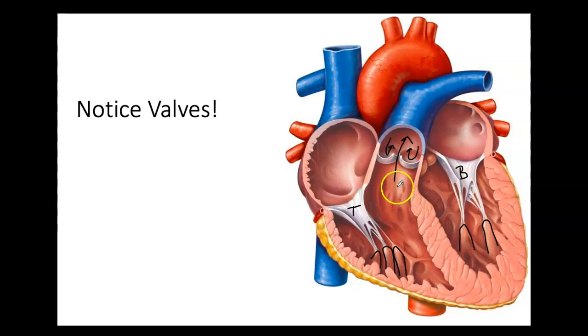We also want to look at the inside lining here, and this orientation of muscles is not smooth. It's sort of got its little caves and indentations, and that is called the trabeculae. We saw that word before in bone, trabeculae carneae. So it is this sort of unsmooth, grainy section of the inside of the heart, or the trabeculae carneae.